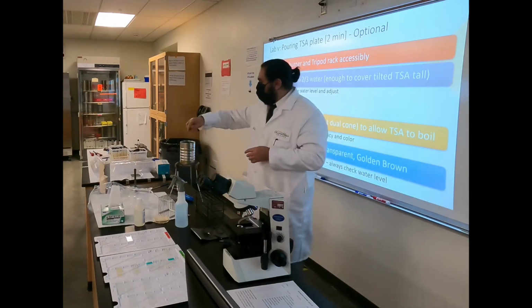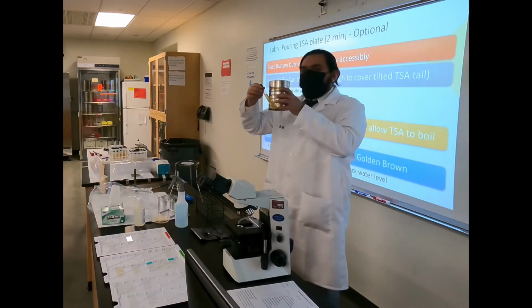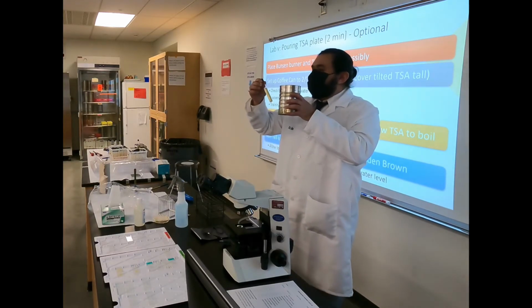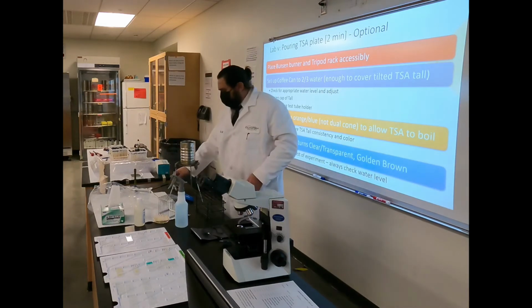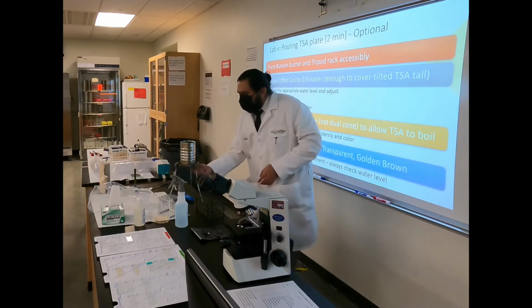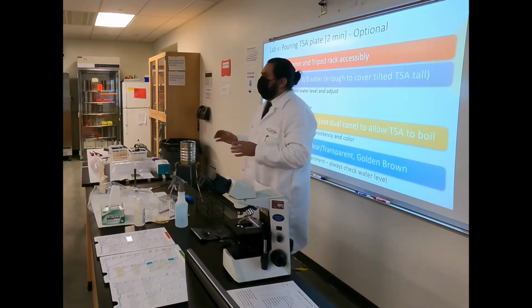You'll find out that, let me show it to you from the side. Using the second one, it'll end up tilted because it's not going to stand up straight. So once it's tilted with the loose cap on, then fill up the water to cover this level, okay? Then, once you have that done, put your Bunsen burner where you need it to be, and between orange to bluish flame, make sure that the flame is touching the bottom without engulfing the entire can. If that means too much flame, kill off the valve a little bit, it should be fine.